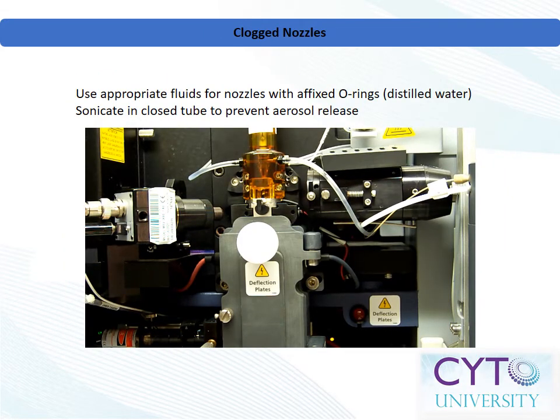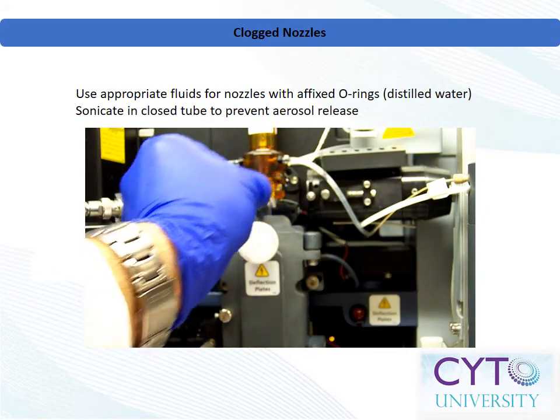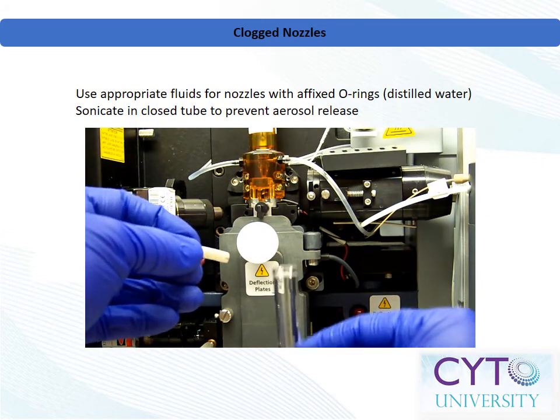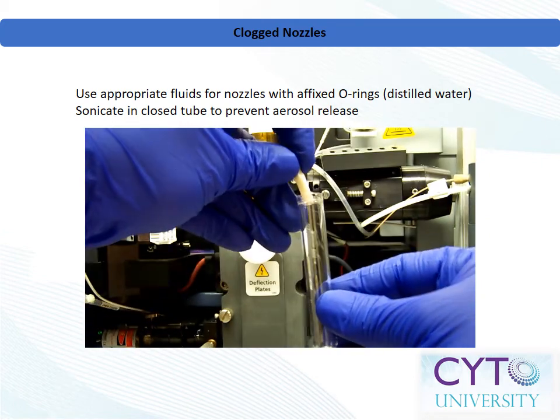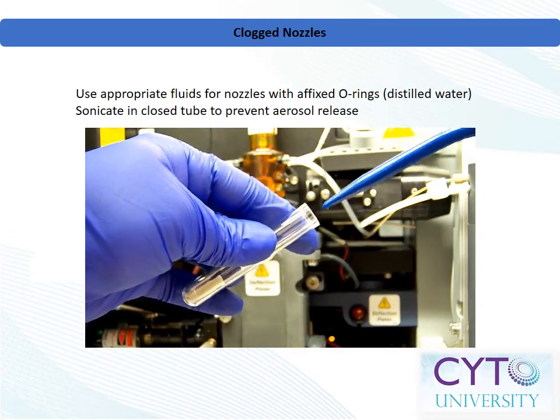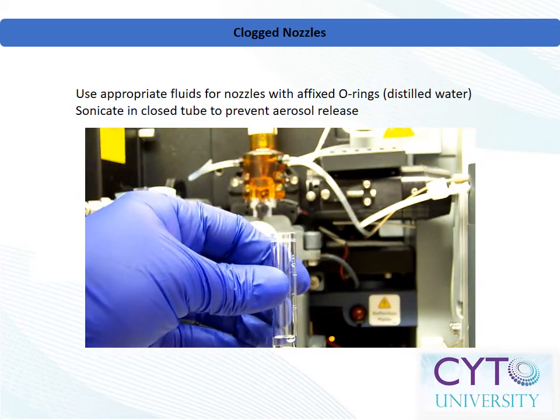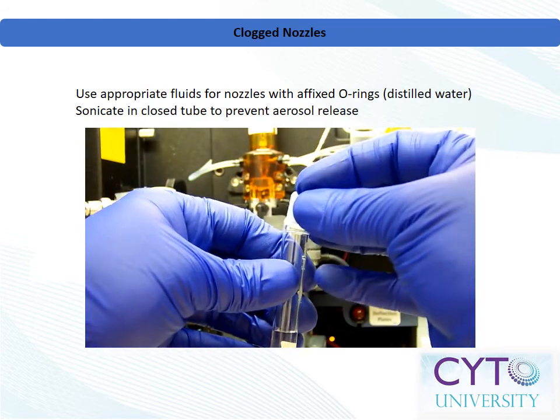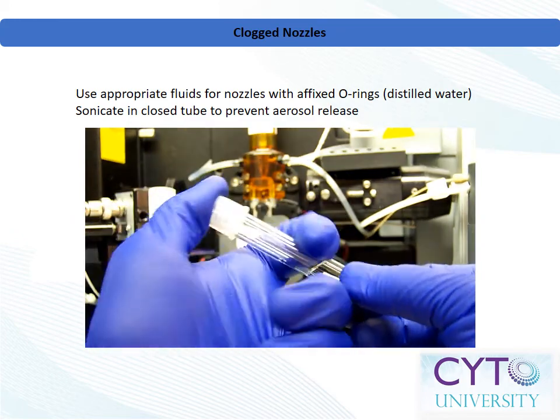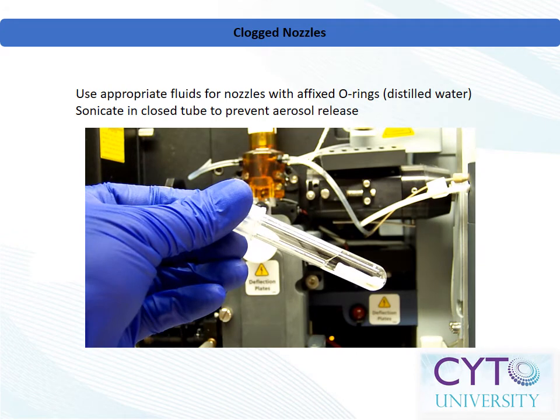In addition to clogs in the sample injection port, cell sorters may also become clogged at the droplet nozzle. For either a stream-in-air or flow cell-based sorter, the easiest way to dissolve a nozzle clog is through sonication. Before you begin, be sure to use appropriate standard operating procedure for the containment of aerosols prior to accessing the nozzle or sort chamber of a clogged instrument. Remove the nozzle from the flow cell and place it into an appropriate vessel for its size.